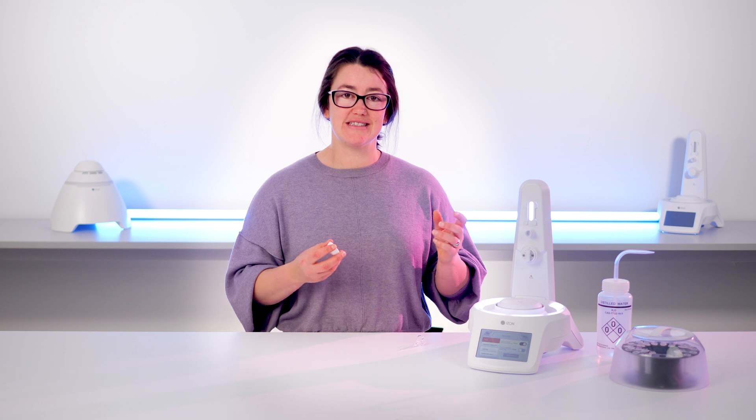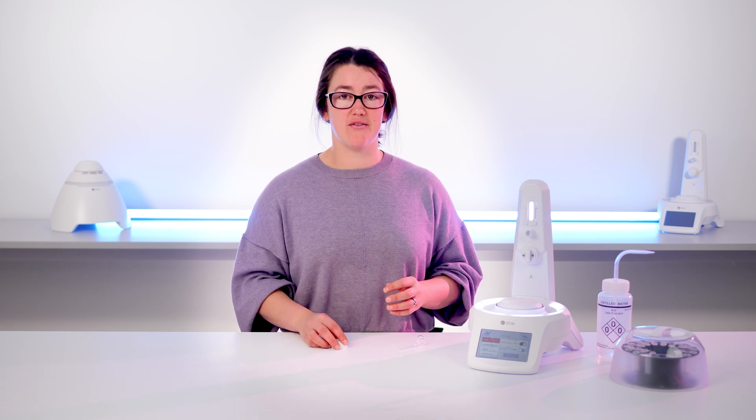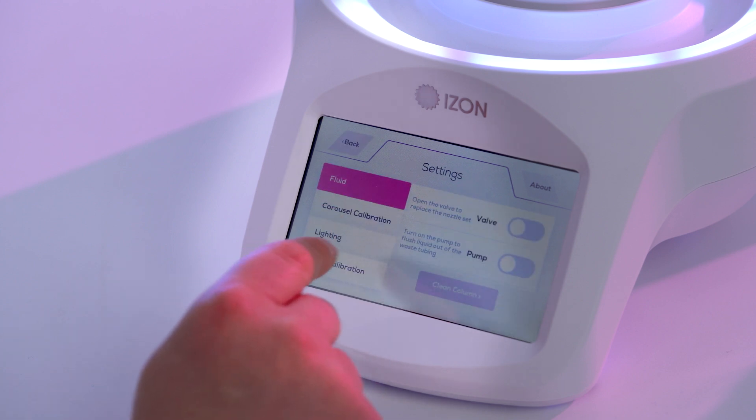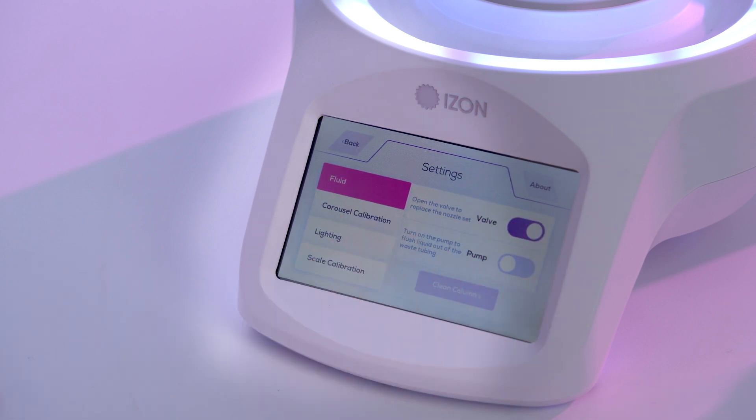The silicone tubing fits in more easily if the valve is open. So open the settings menu, navigate to the fluid tab and toggle the valve open.